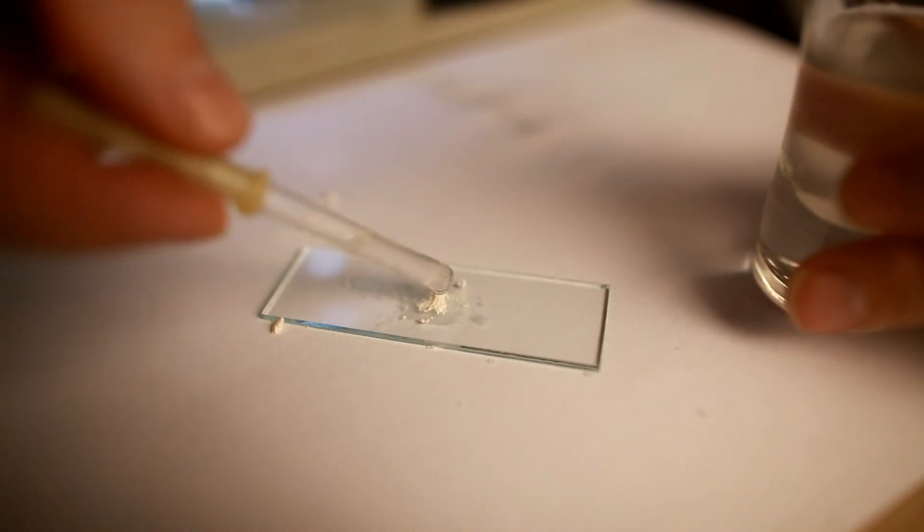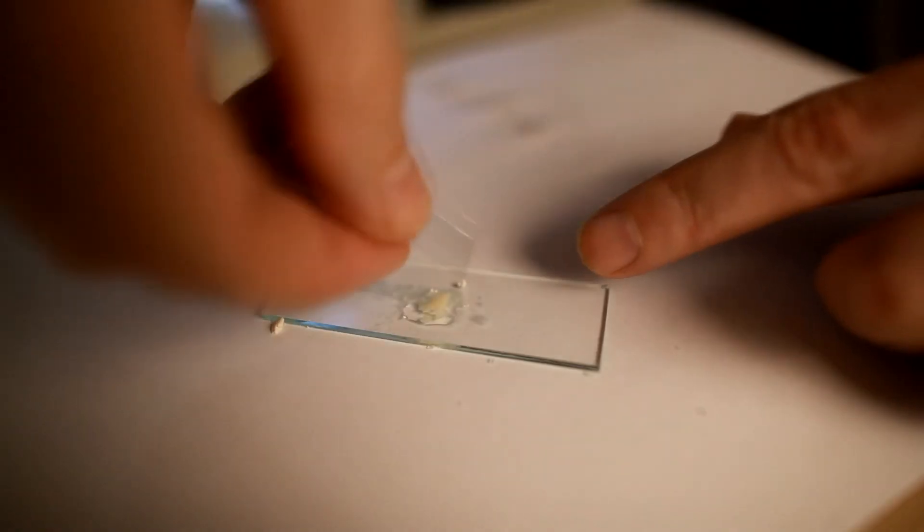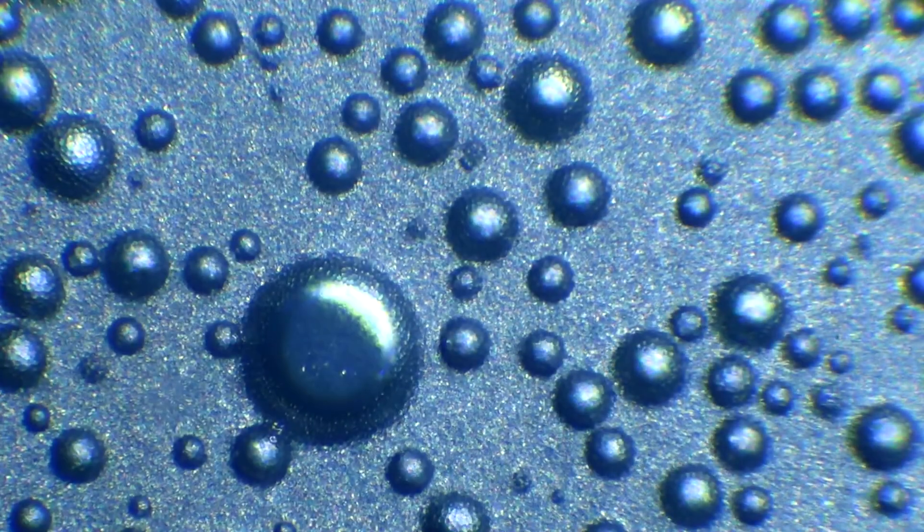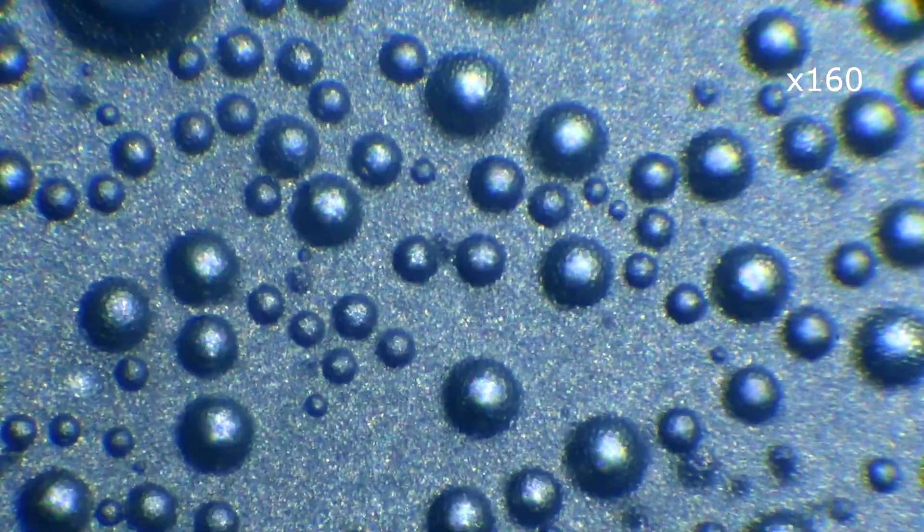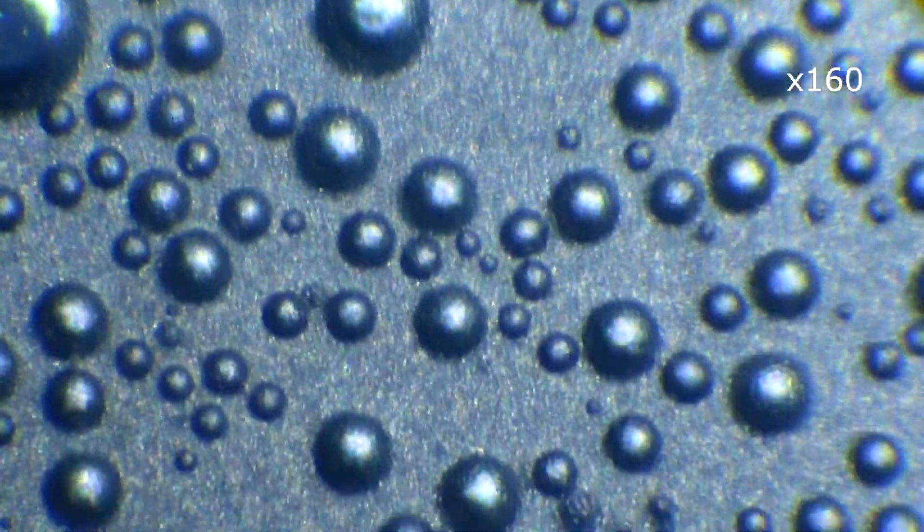We add sugar liquid to dry yeast. Then even with a small magnification you can see the active release of carbon dioxide and the formation of bubbles.